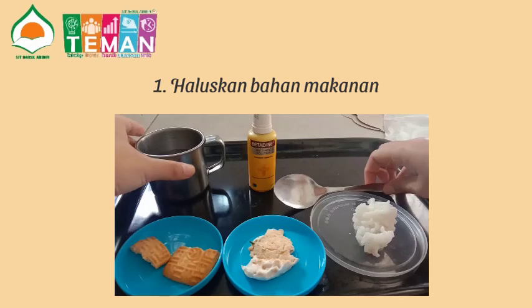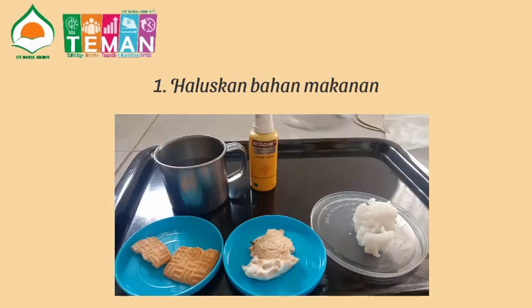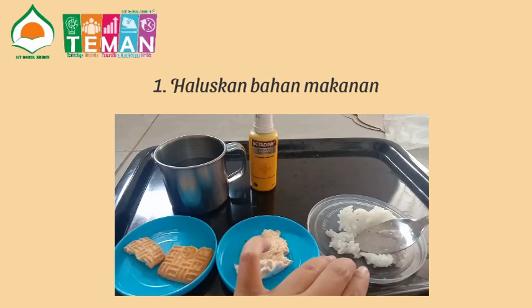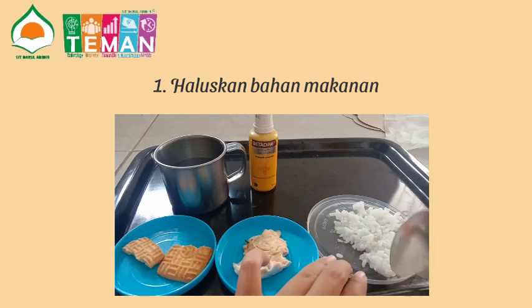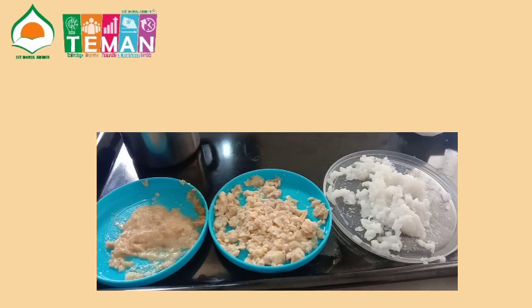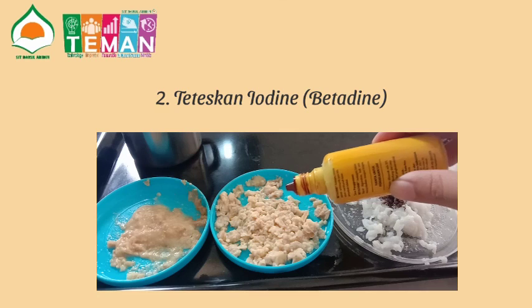Pertama-tama kita haluskan dulu ya semua bahan makanan menggunakan air. Setelah semua bahan makanan halus, langkah selanjutnya adalah kita tetesi bahan-bahan makanan ini dengan larutan iodine yang ada di betadine, sebanyak kira-kira 5 tetes ya teman-teman.